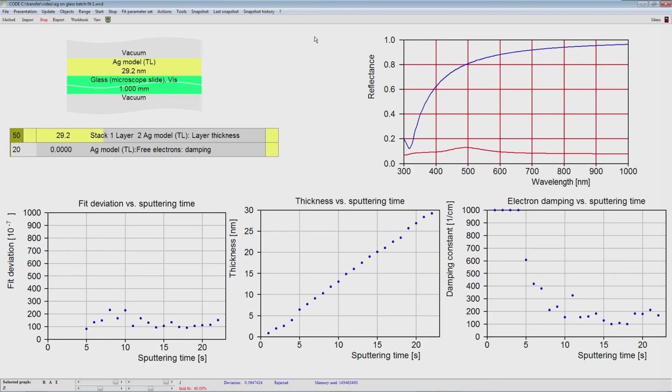Okay, press go. Here in the status bar you will see additional information about the progress of the grid fit for each sample. We will not see updated models while the grid fit is done, only when the downhill simplex finds improved values.